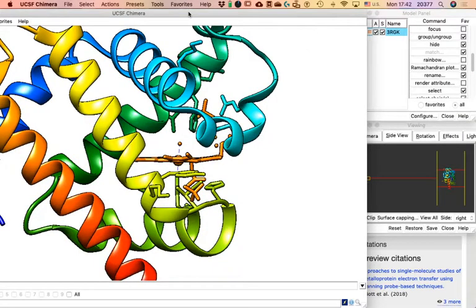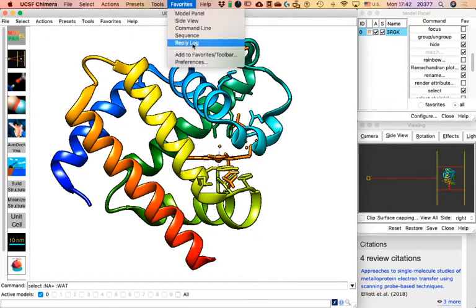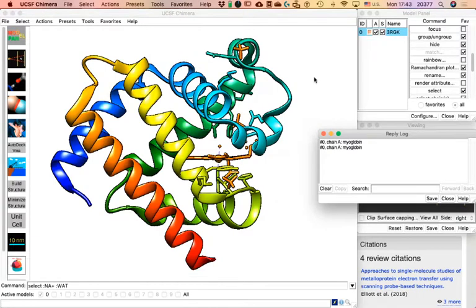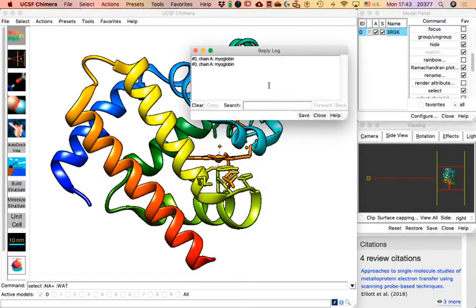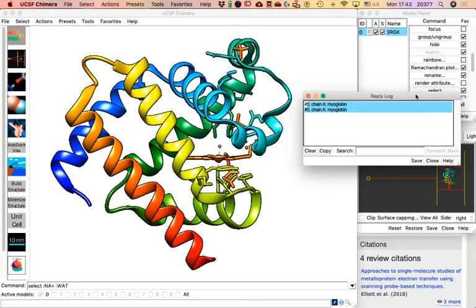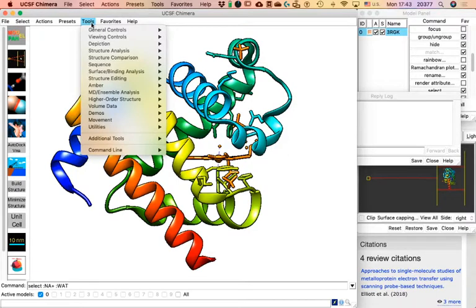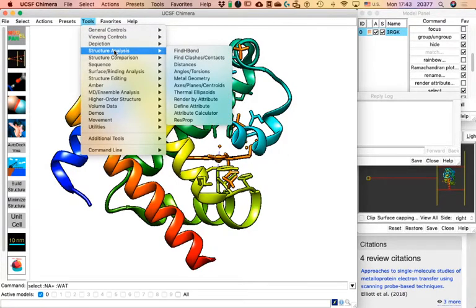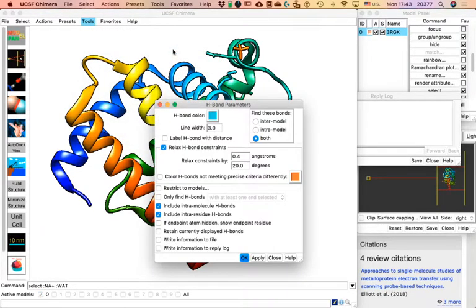Now go to Favorites and click on 'Reply Log.' This reply log — I never understood why it's called that — brings up a text box that is actually pretty useful. Anything you do in Chimera that involves a calculation is written there. If you get information from Chimera that you want to save, you can click Save or just copy and paste. Keep it open and go to Tools > Structure Analysis.